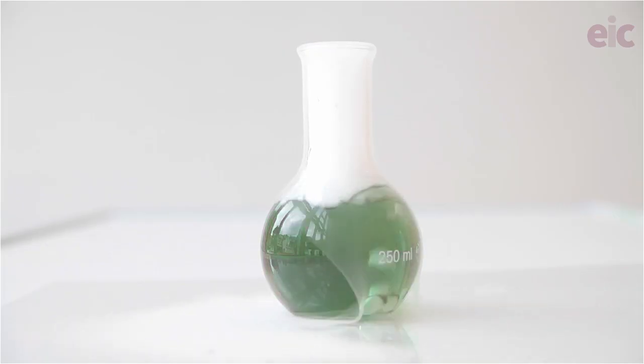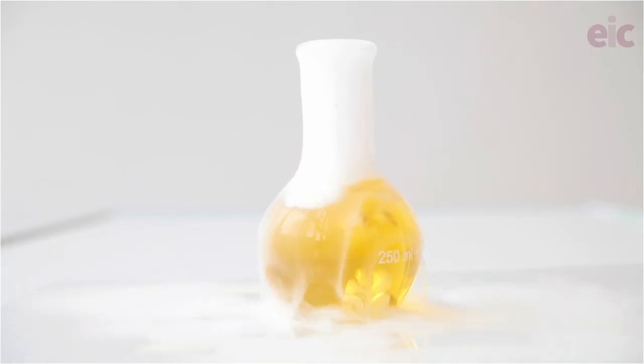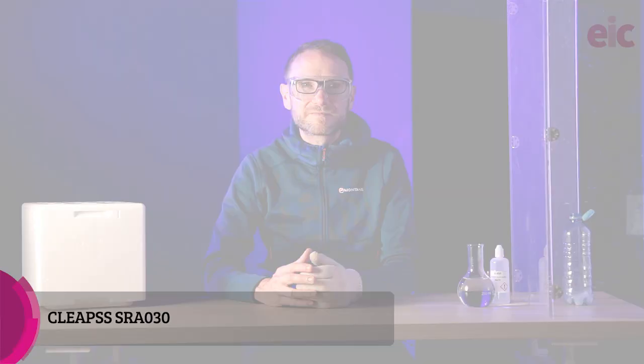The classic thing to do with dry ice is to drop it into water to which you've added some indicator. The changes in colours demonstrate how the resulting solution is acidic. Safe handling of dry ice reduces the risk of cold burns, asphyxiation, and explosions from the gas build-up. Members should check the CLEAPSS website for a special risk assessment, as it's unlikely to be covered by your model risk assessments.